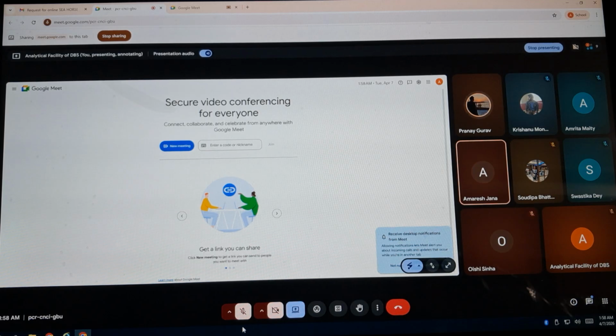Yeah, that is fine, and that's why I have already asked. I do have a raw protocol for that. I could share it, like how to set it up. So please, if you have, then please share it. Yes, sure. Thank you.